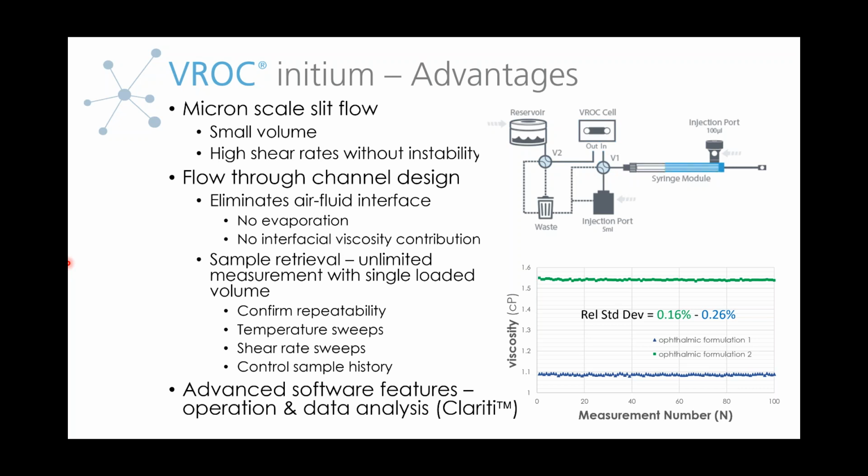And we won't talk a lot about Clarity. We have a separate Clarity information session, but I'll bring it up a little bit, because one of the features of Clarity is that you can import data and do an injectability analysis using one of the equations that we're going to derive and work through here.